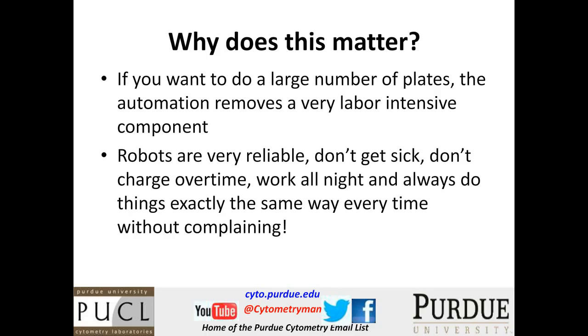It facilitates timing. If you have to add timing in your assay, if you're doing phospho assays or something like that, you've got to stop the reaction at a certain point, and it's got to be precise, and you want the same every time. So that has to be done, and robots are very good at doing that.